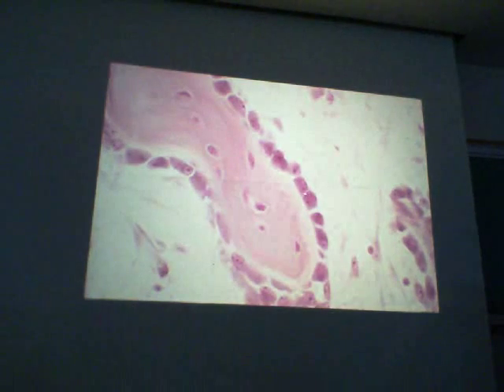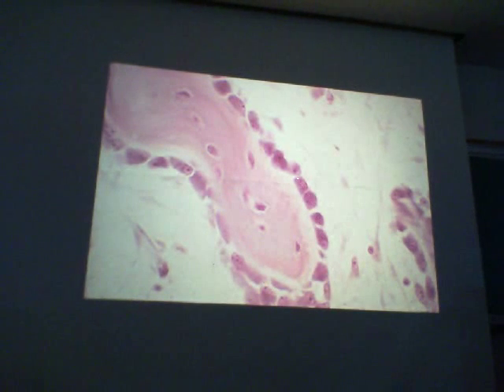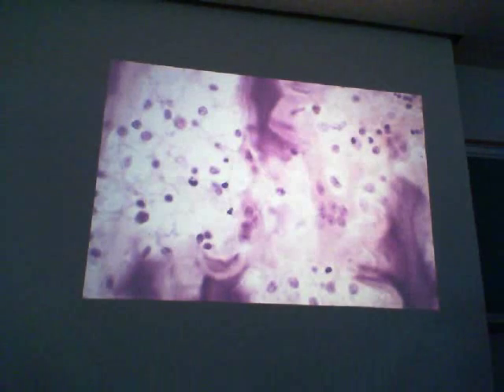And what is this cell right there? Osteoblasts. How about that cell? Osteocyte. What is this lighter layer that we see right there? Osteoid. And this tissue would be what? Bone. Specifically, that would be spongy bone or trabecular bone. And this cell right there, what is that? Yeah, another one right there. So osteoclast.